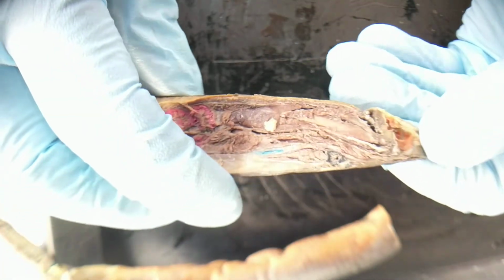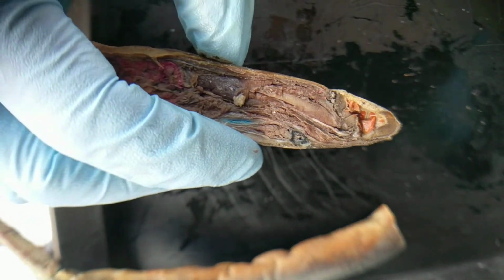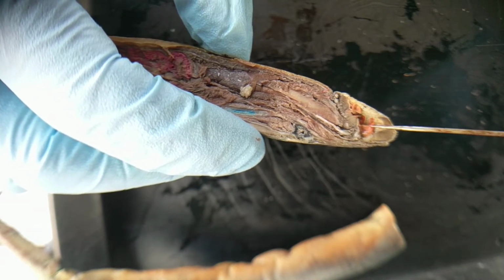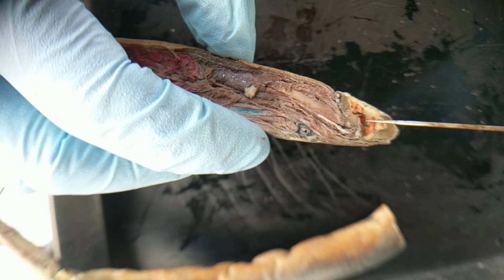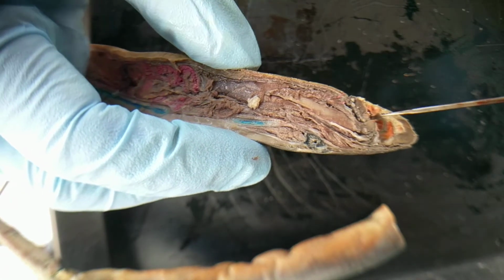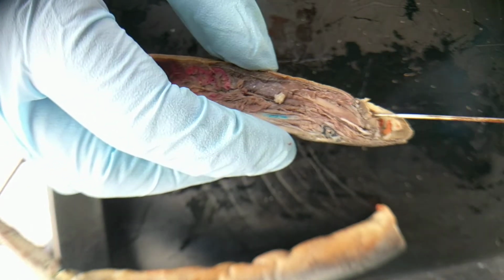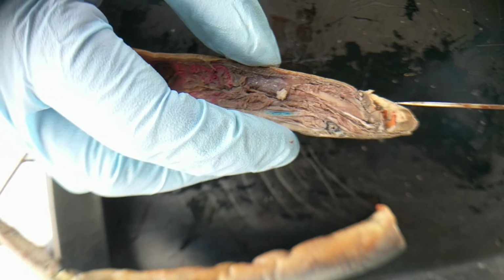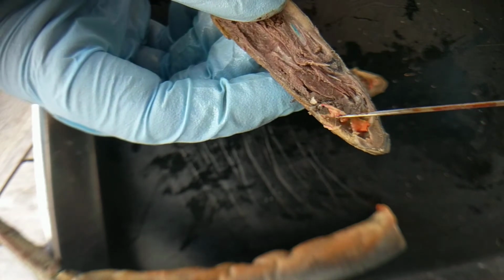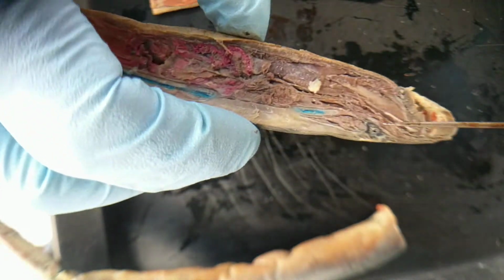So now you might be able to see inside the mouth. So where's this camera? Here we go. That's a tooth. This is really hard, like what I'm touching here is one of the hard teeth. It feels like, you know, stony. And so that is part of the buccal funnel. And the tongue inside of there, actually we can see on the other half, there's the tongue falling out there. So this is just some of the tongue muscle on this side.